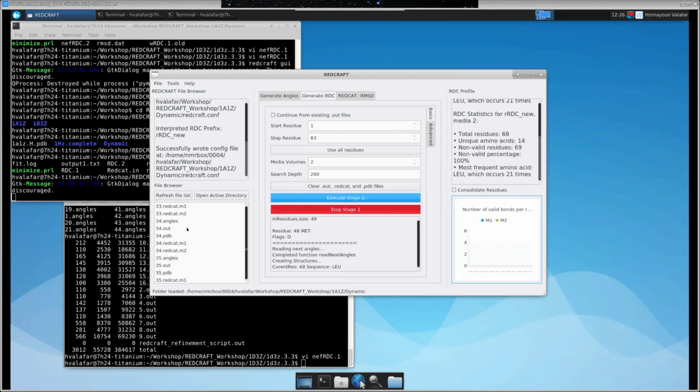For example, you may have a deuterated protein, in which case everything that you want to collect is going to be with amide proton. Right. So NH, carbonyl nitrogen, carbonyl amide proton, all of those will work fine. So yeah, I can with some degree of certainty say two RDCs will work for you.